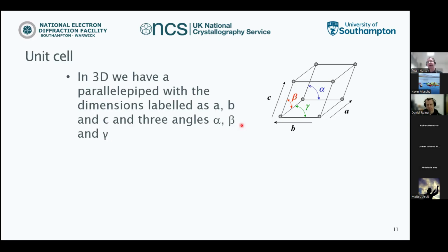If you think about a 10 by 10 by 10 micron crystal, there will still probably be at least a billion unit cells inside. So when we're solving structures and doing everything else with it, we only have to consider the unit cell. We don't have to consider all the repeats. And if you think about averaging over a billion, we will see the average and nothing else. So we need it to be the same, but everything will be an average. We're always observing averages.